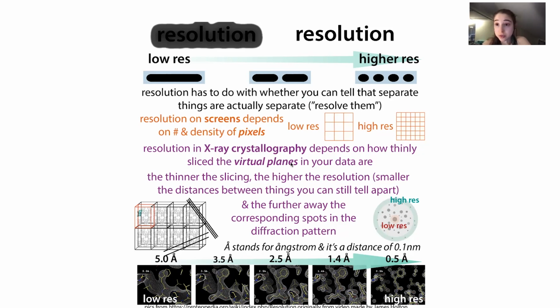It's important to note that the resolution cutoff is going to be for the entire crystal. This diffraction pattern is coming from the atomic makeup throughout the entire molecule. You can't just take one of these spots by itself and figure out anything.